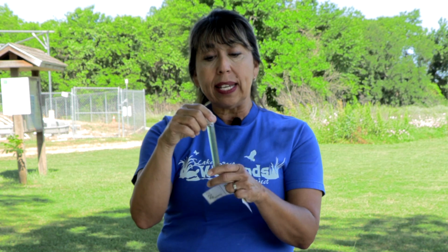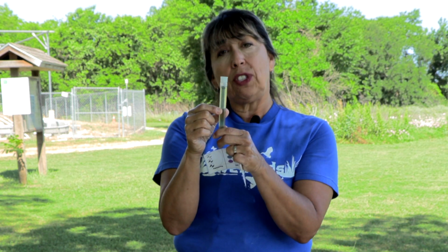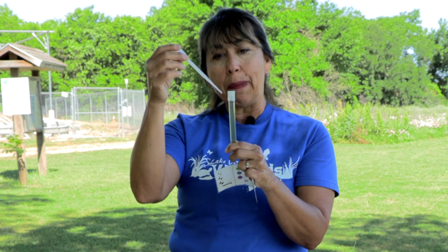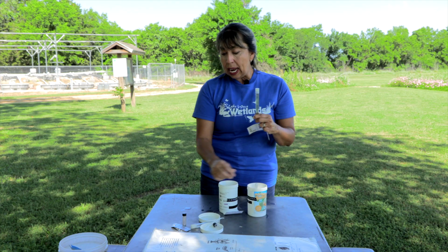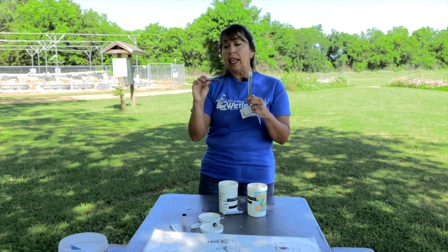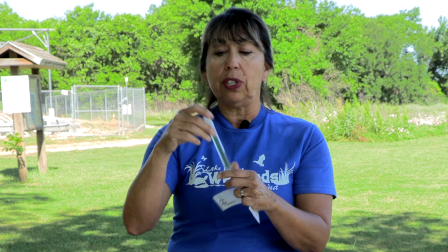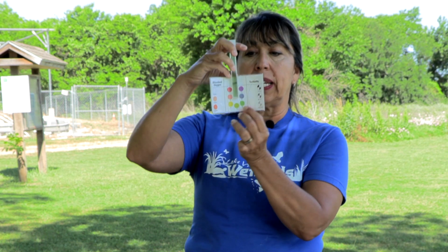So what we did is we filled up our test tube right in here all the way to the 10 milliliter line using a pipette. We just got wetland water and put it in there. And then we have different reagent tablets, and we used one on this one. We put it down into our solution, and you just mix it for a little while until the tablet dissolves and it changes into this particular color.